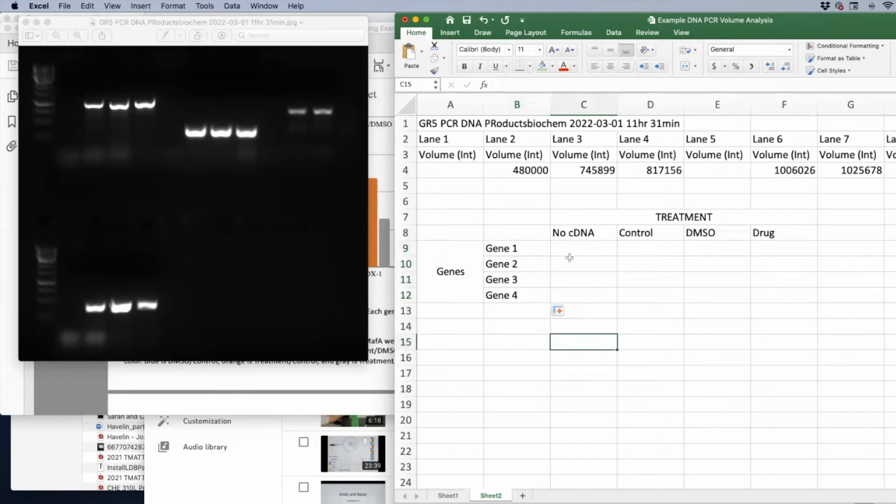Okay, everyone with me so far? Cool. All right, so these guys laid their genes out the way I basically instructed everybody to. Again, on the PowerPoint slide, I said like 4 lanes, gene 1, 4 lanes, gene 2, 4 lanes, gene 3, etc. And they kept everything nice and labeled, so it looks like everything is the same, right?